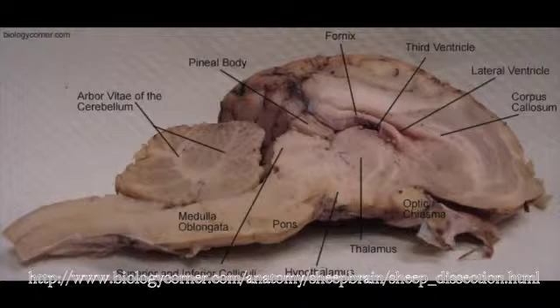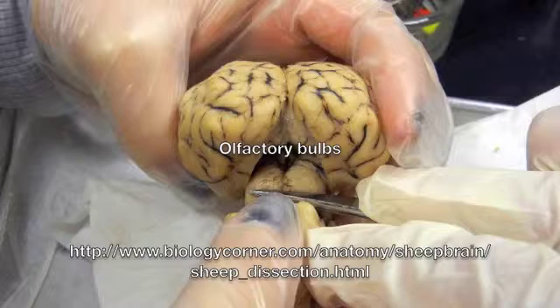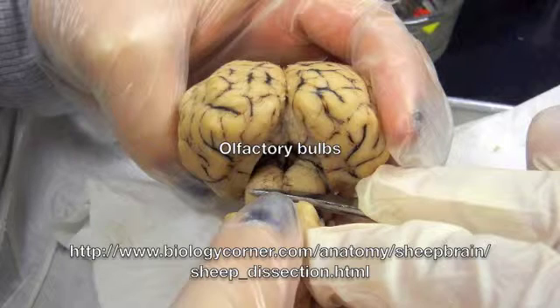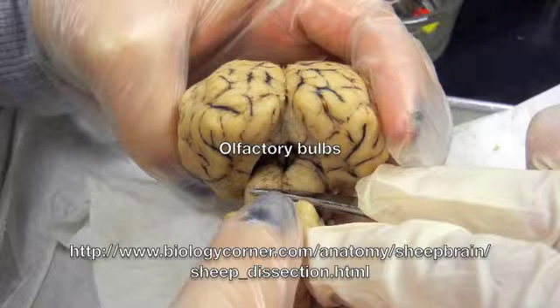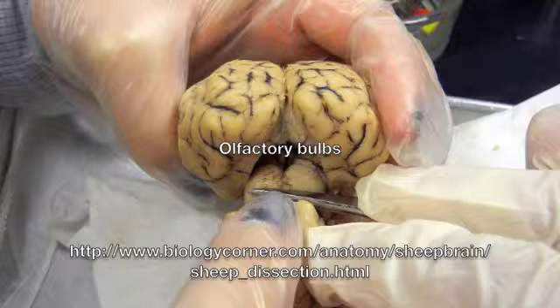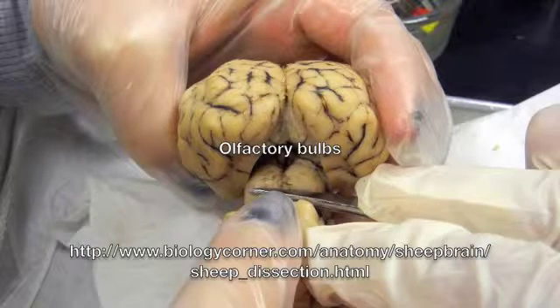In addition, it helps to relay input and signals between the brain and spinal cord due to its position on the brainstem. The olfactory bulbs are located in the frontal lobe. Its main function is to relay olfactory stimulus to other structures of the brain, largely controlling our sense of smell. The olfactory bulbs help to filter through the many smells we encounter, ensuring that we become aware of any unfamiliar, potent, and potentially dangerous smells around us.